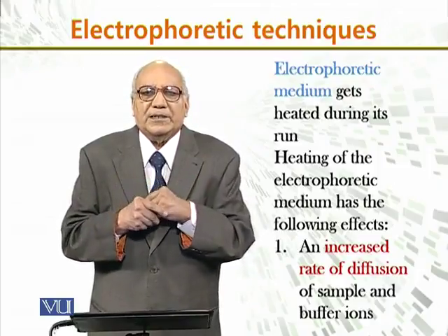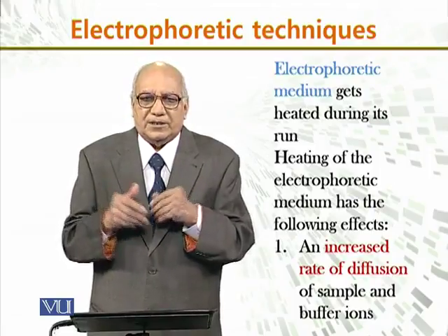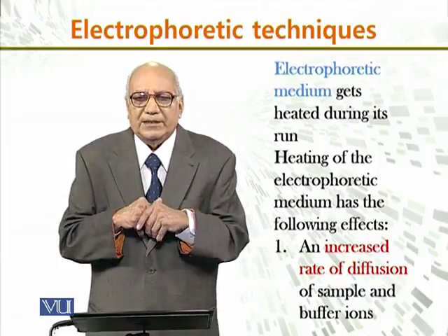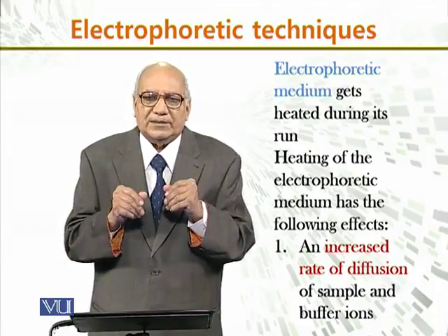Now, the electrophoretic medium gets heated during the run when a potential is applied, and heating affects the electrophoresis in the following manners.